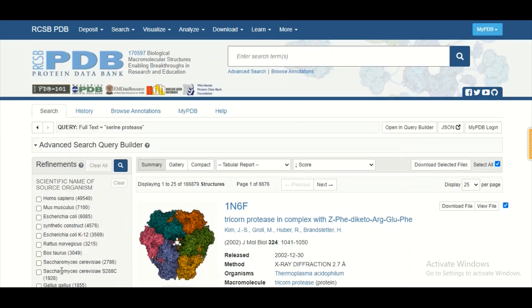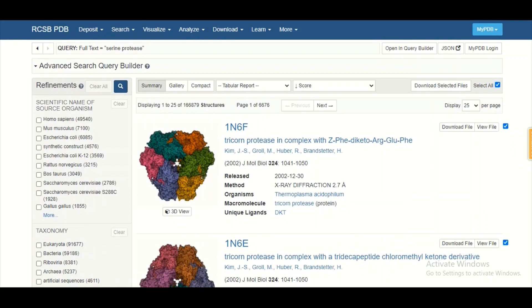On the left side, you could have a breakdown of the results. For example, you can see how many structures related to your query belong to human, how many belong to muscular, and how many belong to E. coli and synthetic construct, and so on. This is a breakdown with reference to the organism in the Protein Data Bank.